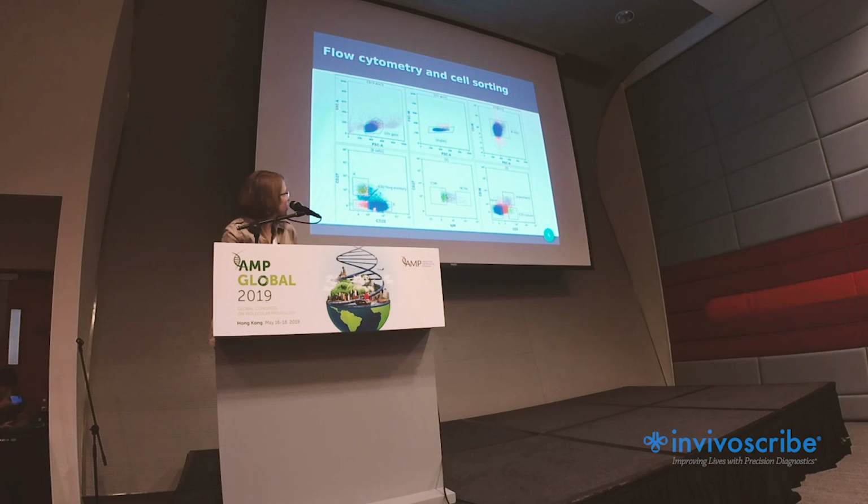So those negative in both are CD27 negative memories. The CD27 positive ones are subdivided by IgM expression into class-switched memory and non-class-switched memory. And the CD23 high expression ones are subdivided by CD5 and CD38 into naive, CD5 mature, and transitional B cells.